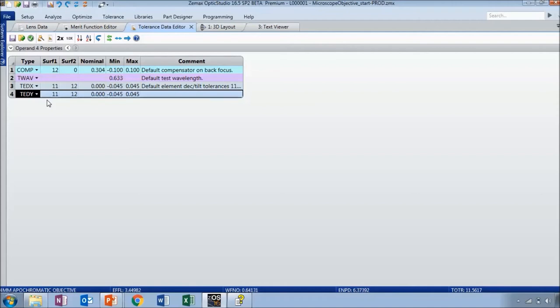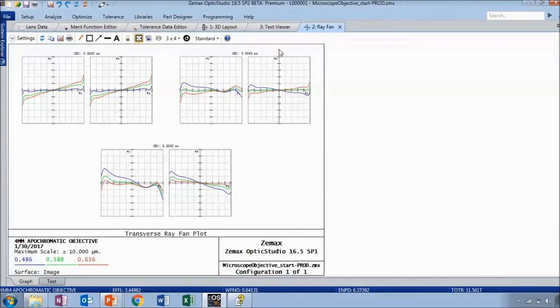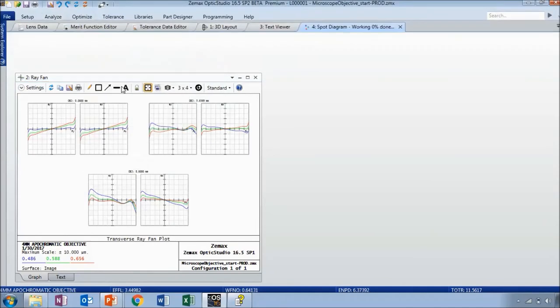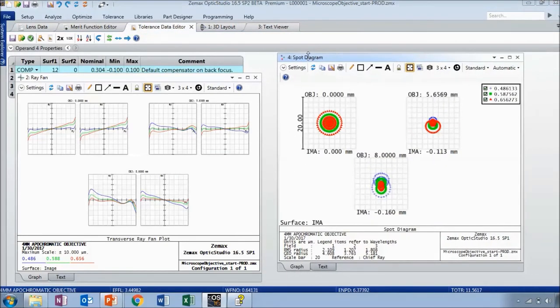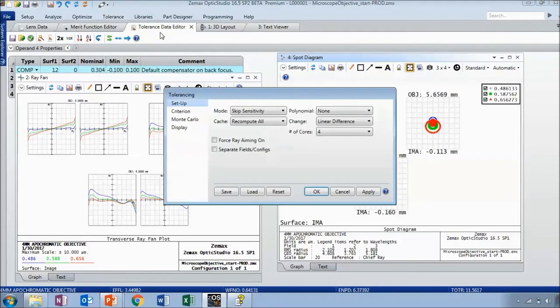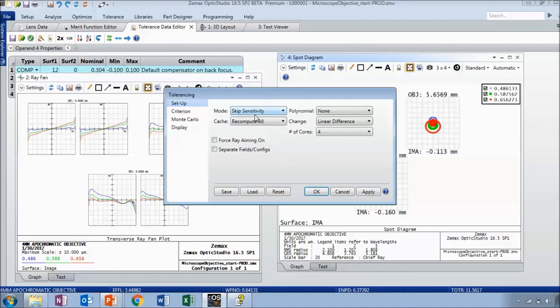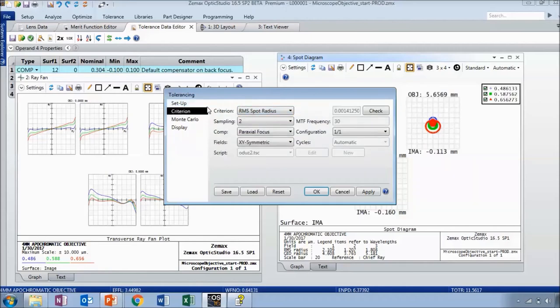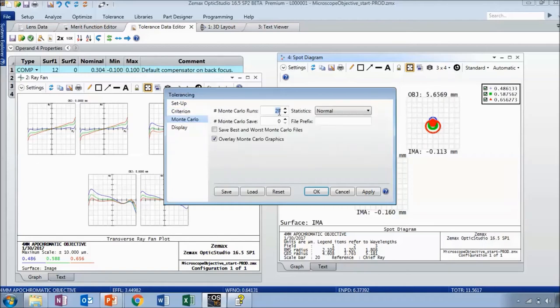In reality there will be some variation of all of the tolerances combined, and this is what a Monte Carlo simulation will calculate for you. I'm also going to open up the ray fan and spot diagram so we can see the resulting effects. In the tolerancing analysis, I'm now going to set the mode to 'Skip Sensitivity,' which means it will skip the individual sensitivity calculations and jump straight to the Monte Carlo simulation. The default number of Monte Carlo runs is 20. Make sure you check 'Overlay Monte Carlo Graphics' so it creates 20 different files with some variation of decentration in X and Y for the last element.